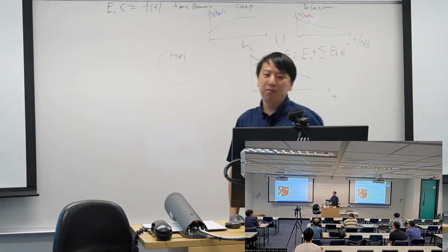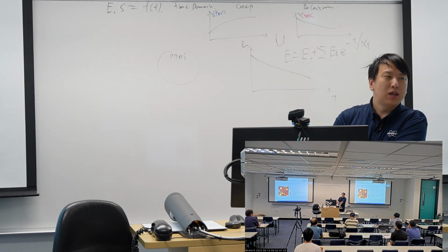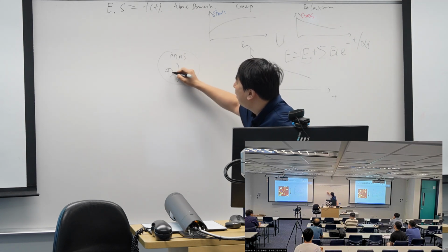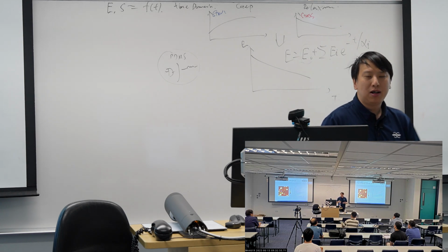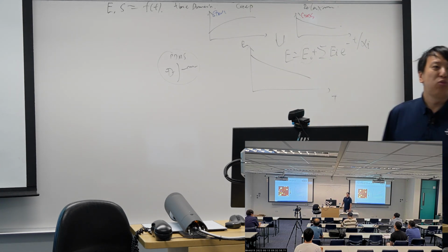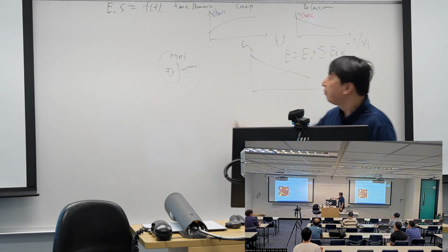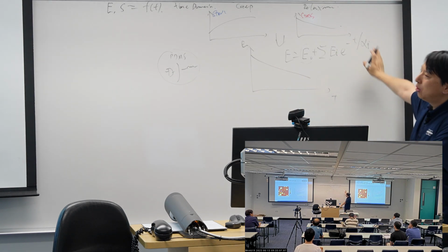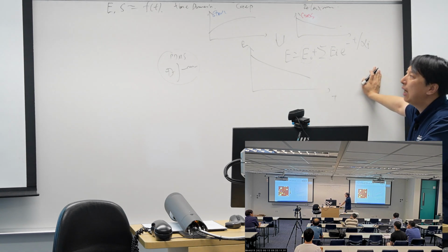Inside the PDMS, it's hard for us to detect this part is a damper, this part is a spring. It's hard to figure out which part is viscous and which part is like a spring, just based on the chemistry structures. So this kind of time domain description seems too mechanical.